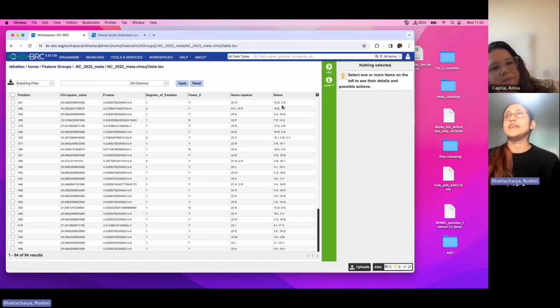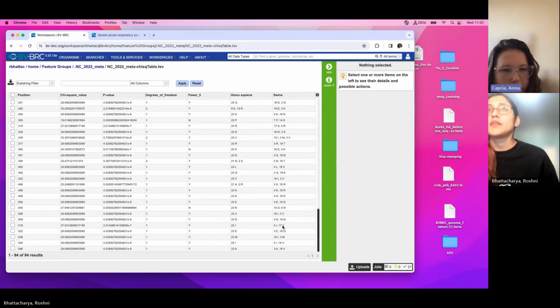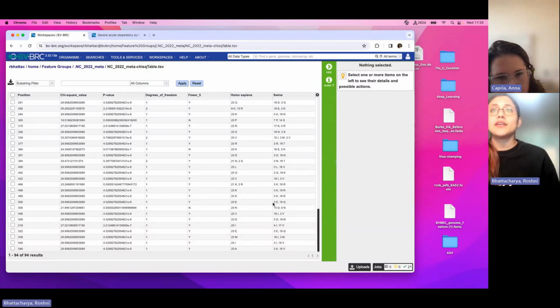Let me ask. Yes, Anna. So I might have just missed it, but you pointed out the swine proteins that are like the human, but there's some positions that are not discriminate between each, like 394. Or no, that wasn't a good example. I think you're talking about something like 505.